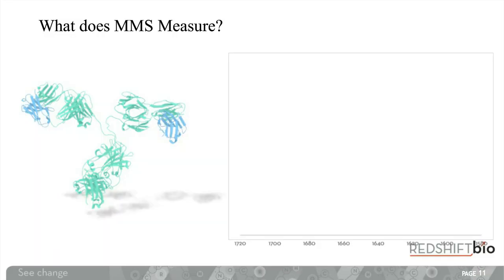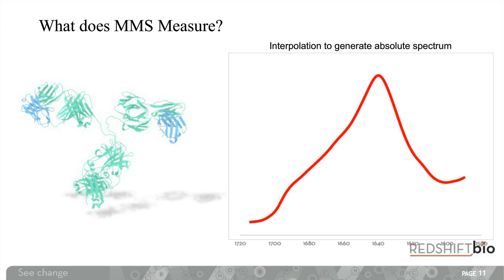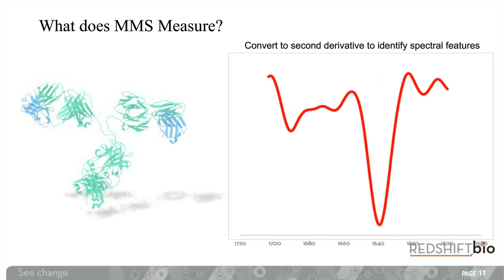So when we have recorded your data, as I showed you before, taking data points every 4 centimeters to the -1 and interpolating this into a spectrum, we then do some processing on your data automatically as part of each measurement you make. First of all, we take the gradient of that line, or create the second derivative plot of your spectrum in order to discern different features that may be present within your spectrum.